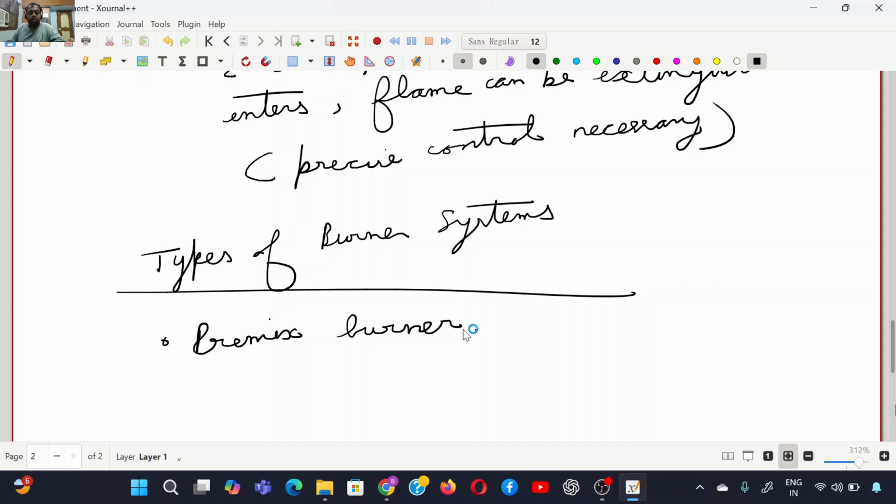It produces a laminar flame with controlled temperature and droplet distribution. So it's a laminar flame. So advantage is low turbulence. It's a very stable flame and then reduced noise in signal. The disadvantage is that it is susceptible to clogging if solids are present in the sample, potential explosion hazard if not handled properly, and atomization efficiency is 10 to 15%. Okay.